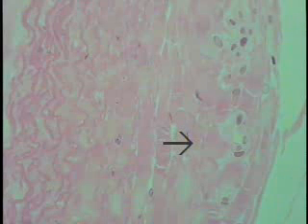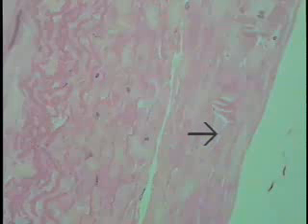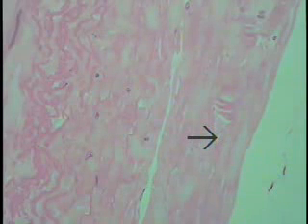And one can see as we go to the exterior surface, it is made up of coarse collagen fibers and scattered fibroblast nuclei, and other cells, probably some smooth muscle cells scattered, but not in predominance at all. They come and go in this particular layer, and are highly scattered. If we took another field, some of these aren't present. So there are some present, but they aren't a substantial number. And an occasional basophil will be located also in this adventitial layer. So this is the muscular or distributing type of vessel or artery, seen at high magnification.